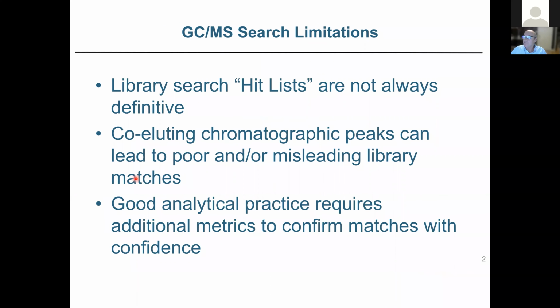and talk a little bit about GCMS search in general, and just go over some of the issues of today's GCMS library search, qualitative analysis, unknown ID. First of all, GCMS search has been around for a really long time, and it's a very, very powerful tool. The libraries have grown significantly over the past 30 years, and they're very good libraries, high quality, with a really broad coverage. Unfortunately, not much has really changed.